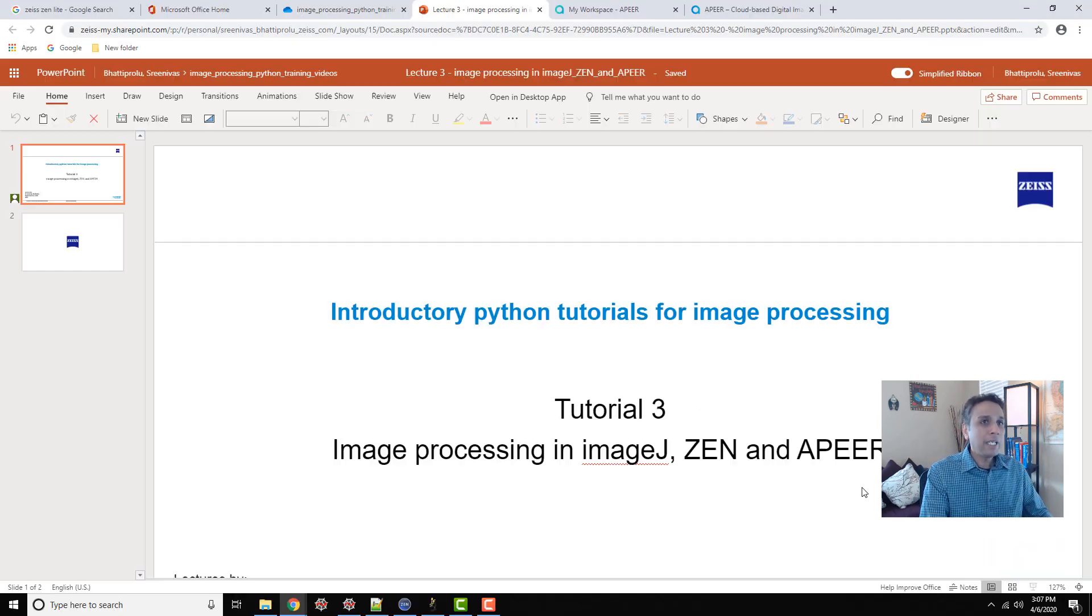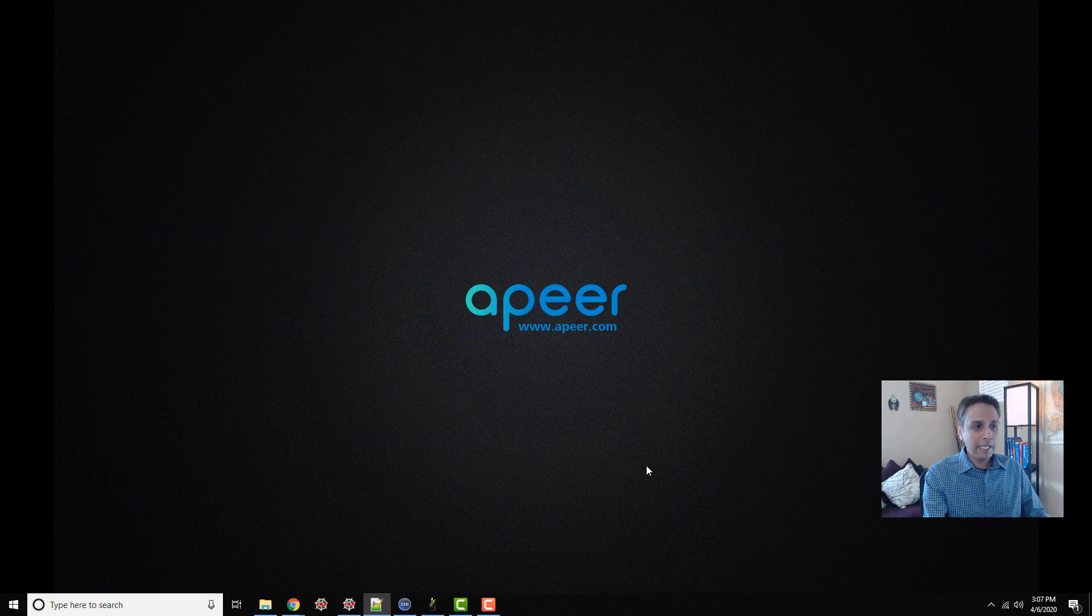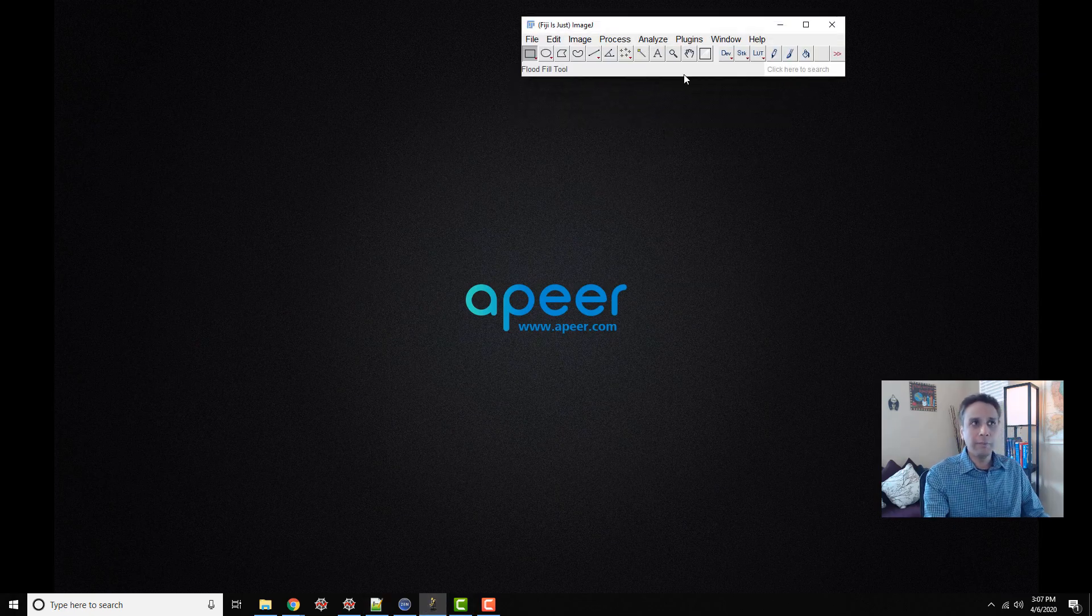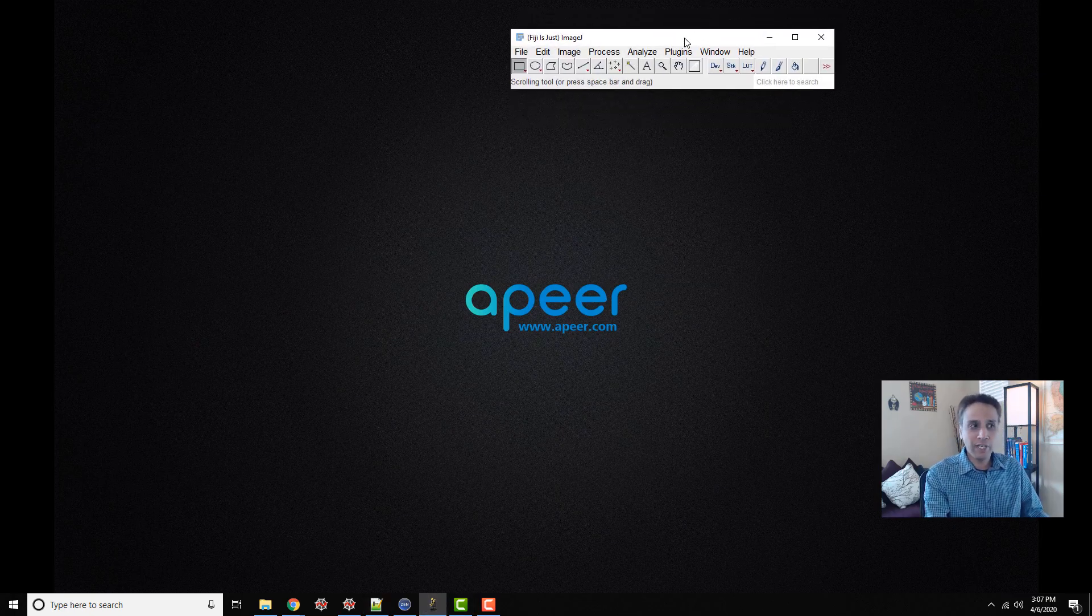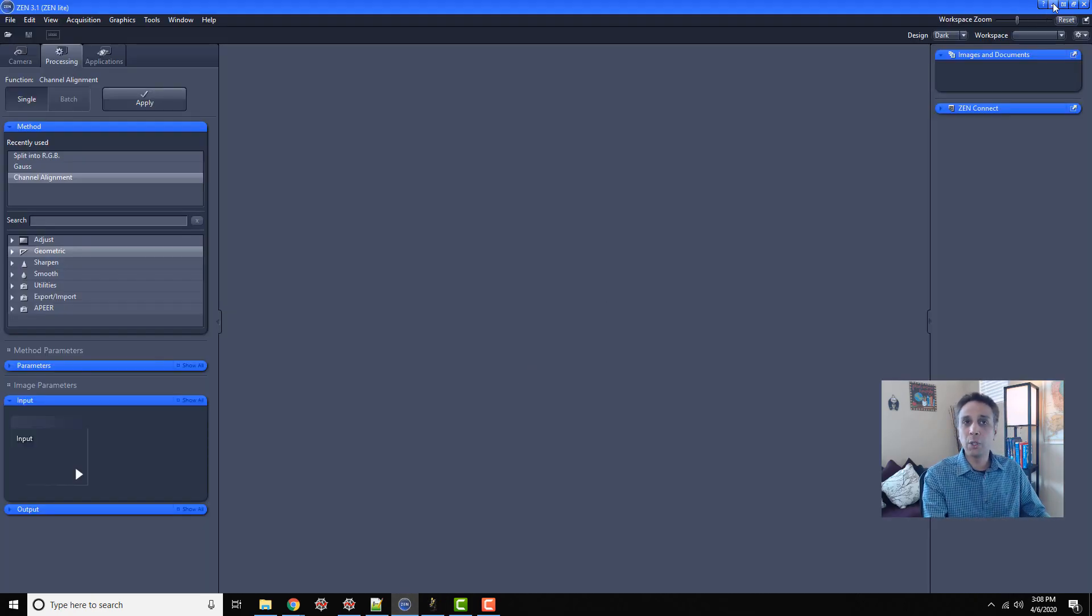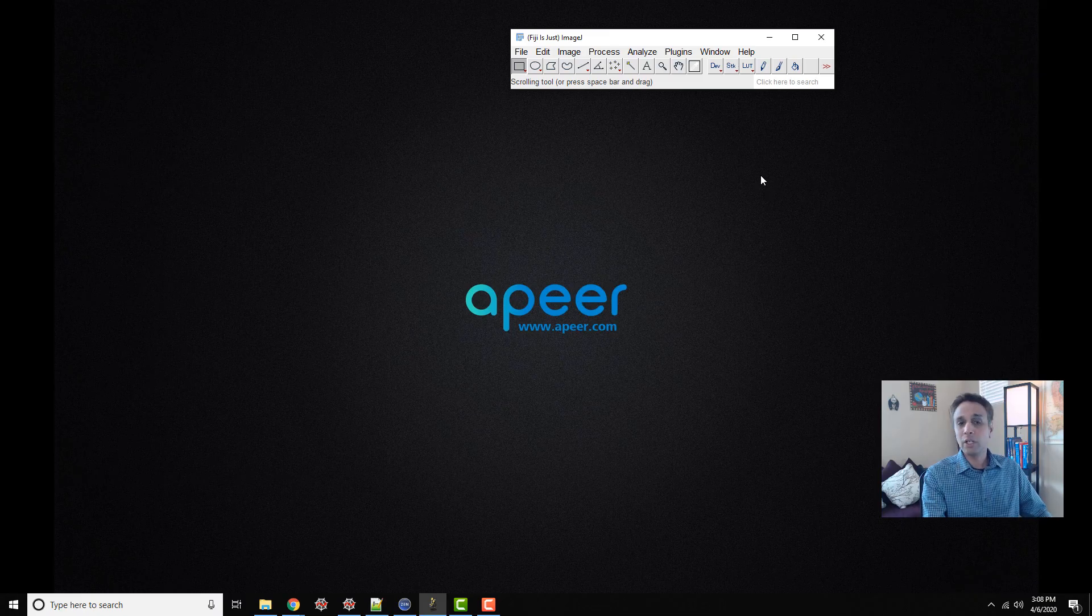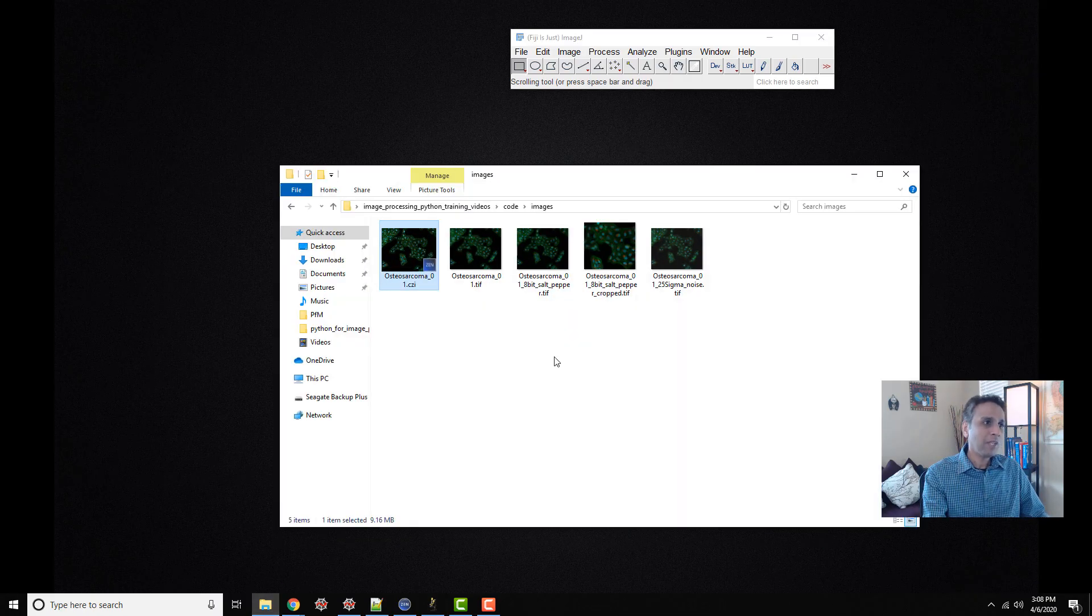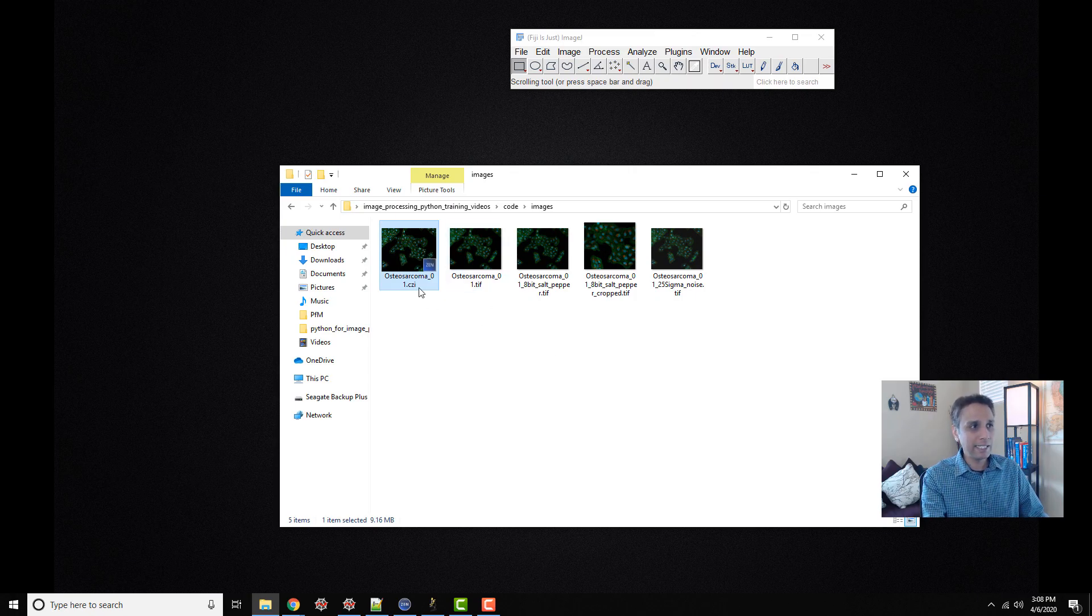Let me jump into ImageJ. Most of you probably worked with ImageJ and you can download it. It's free. Zen can also be downloaded. Let's have a quick look at ImageJ. Now let's open an image. Images come in many file formats and I have the same image in CZI and TIFF formats.